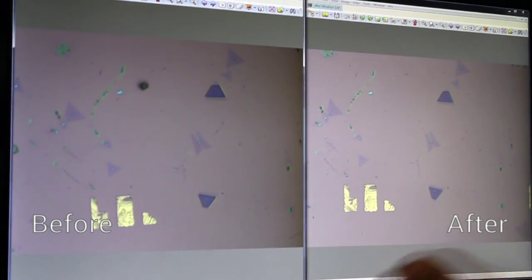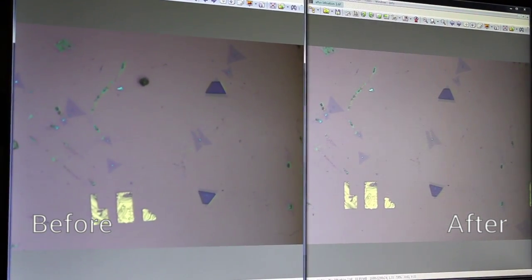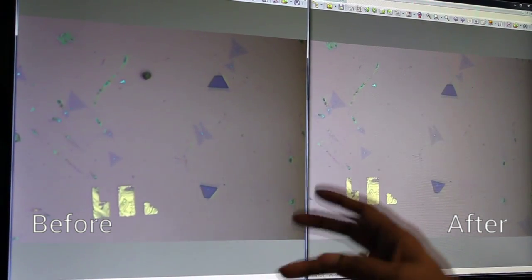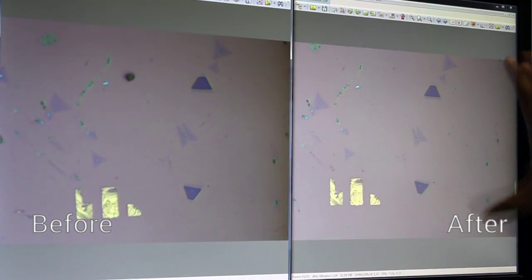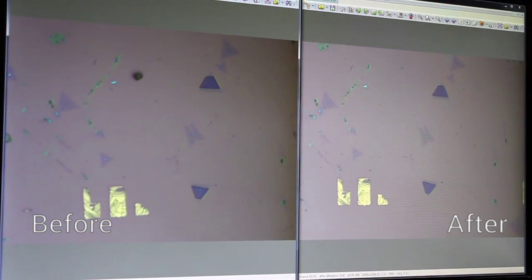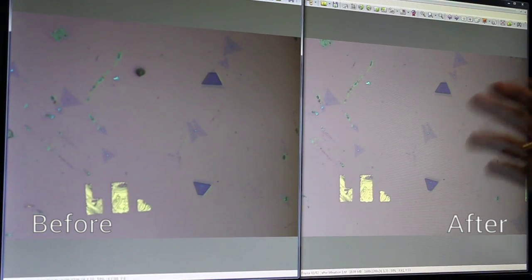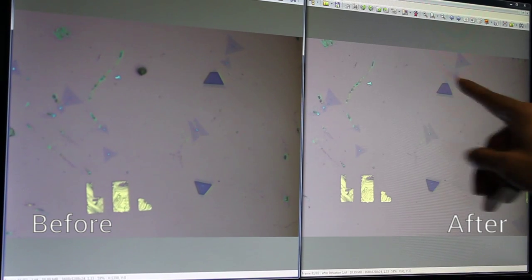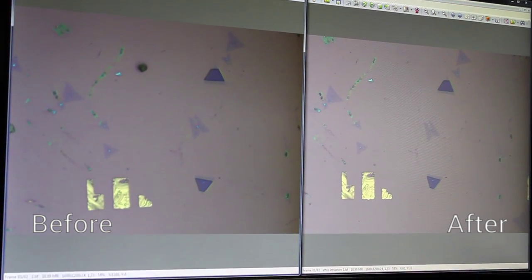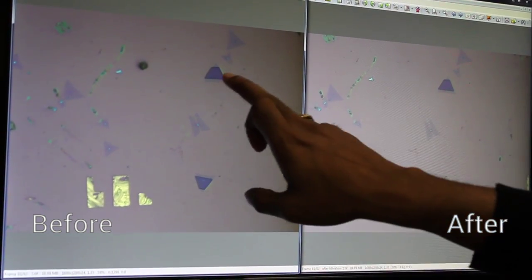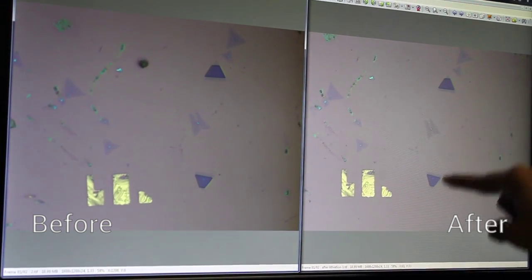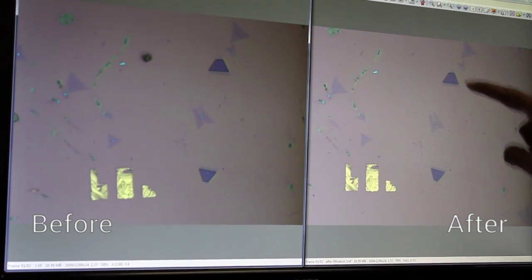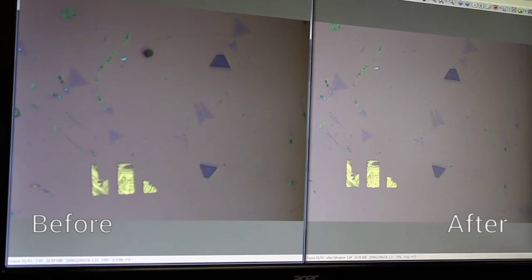These are the other two flakes we worked with on the same sample. The images taken before any processing and after lithium intercalation and all washing show that the flakes are still present and nicely cleaned. The unexposed regions remain in the 2H phase, but the exposed region has been converted to the 1T phase.